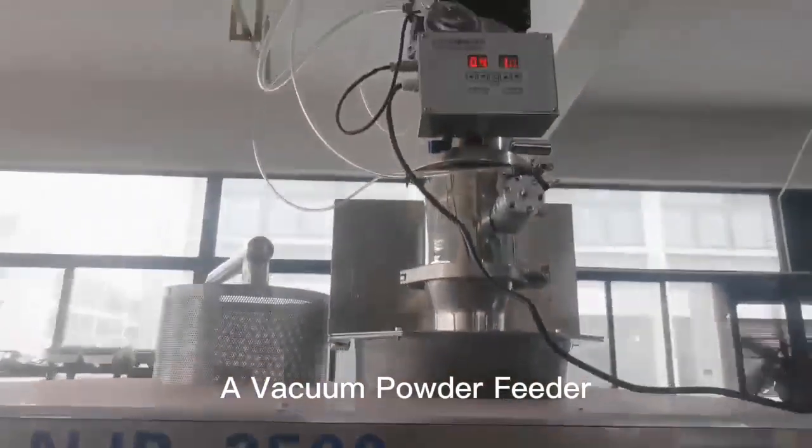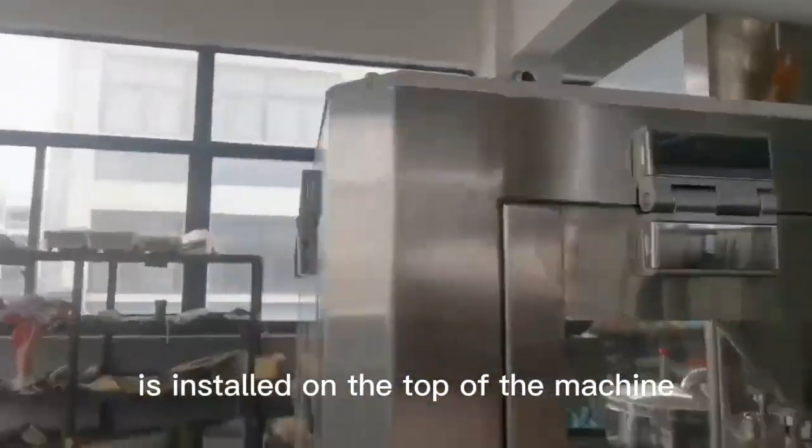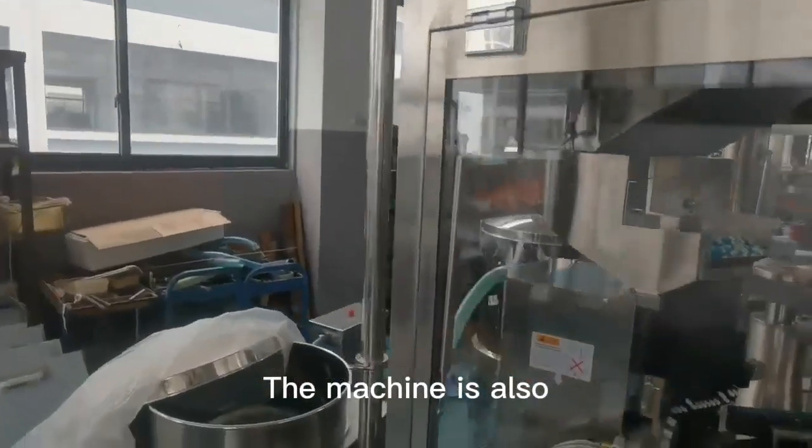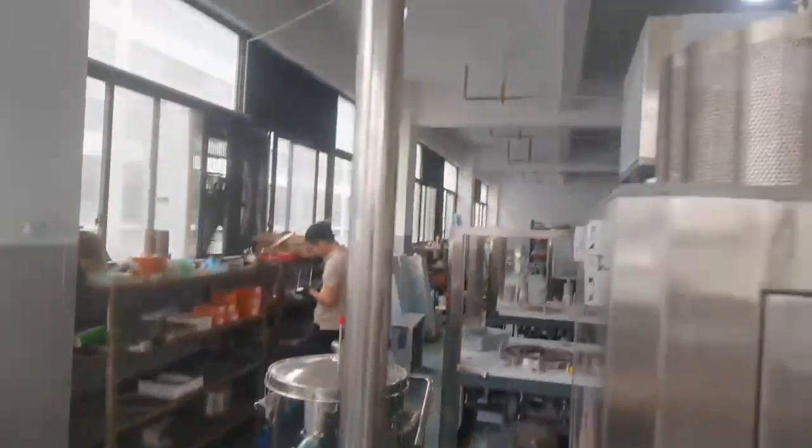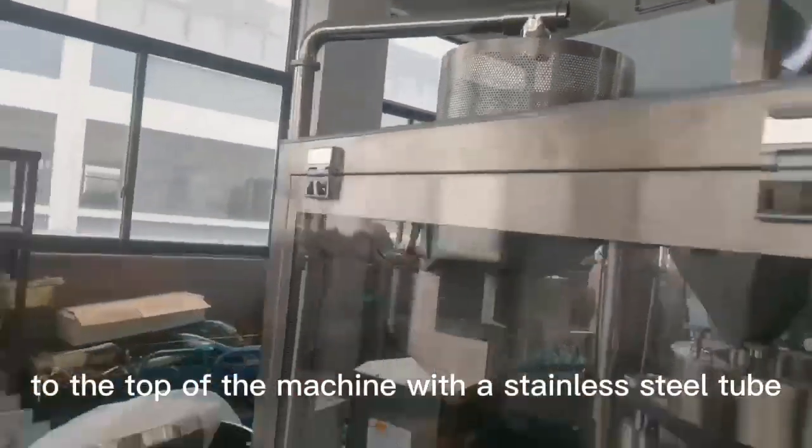A vacuum powder feeder is installed on the top of the machine. The machine is also equipped with an empty capsule feeder, which is connected to the top of the machine with a stainless steel tube.